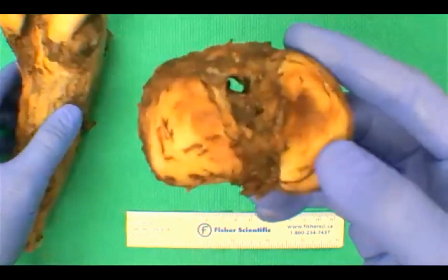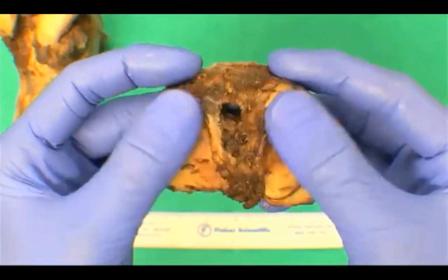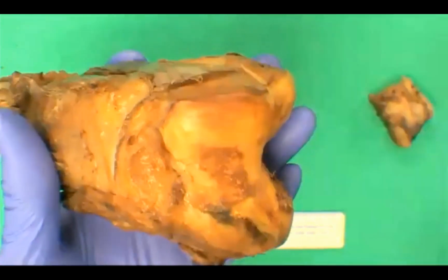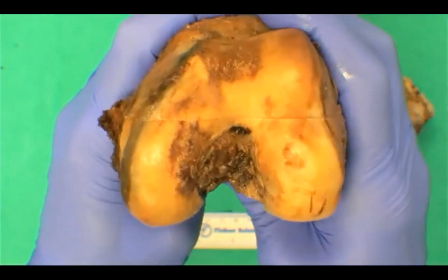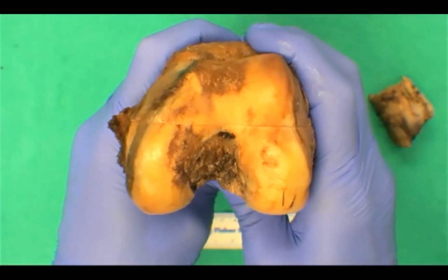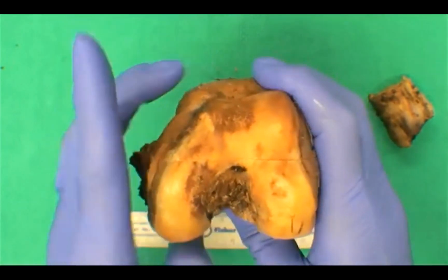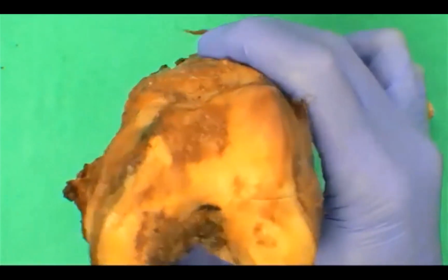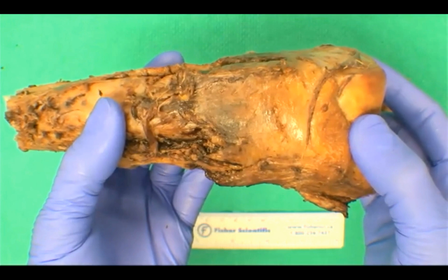The tibial plateau is much more flat, and this is just the top part of it resected here with the specimen. Together here, it articulates. Very nice. So when we're looking at the femur in terms of orientation, we can see the condyles. Generally speaking, the lateral edge has a more gradual slope, and the medial is a little bit steeper. So this is a segmental resection of the distal femur.